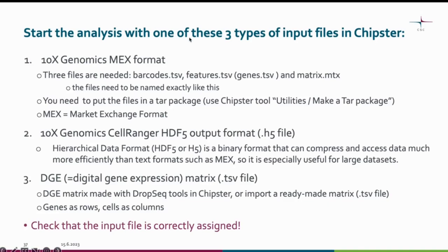Let's start with the input file options. You can start the analysis with one of three input files: either the 10x Genomics output files in a TAR package, or a HDF5 output file from the 10x Genomics Cell Ranger ending with .h5, or a digital gene expression matrix generated with DropSeq tools in Chipster, downloaded from GEO, or provided by a colleague.